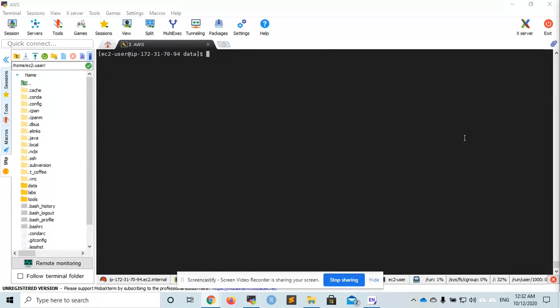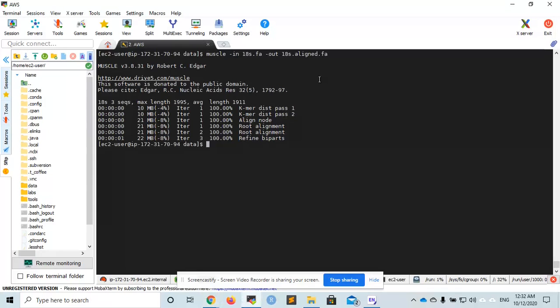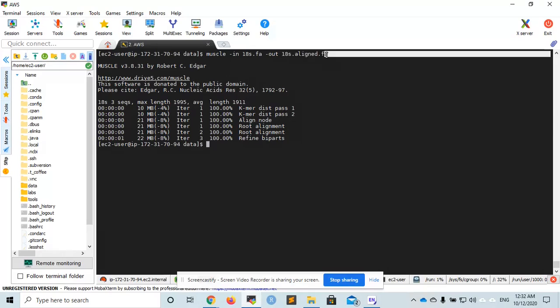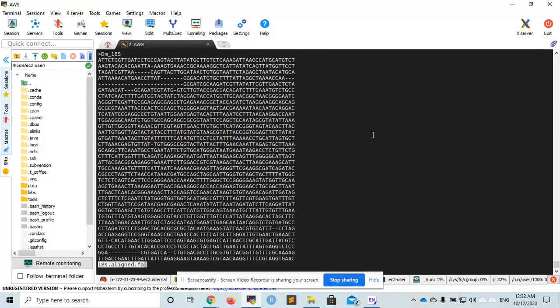We can use MUSCLE to align the sequences, and the output will be another file called 18s.aligned.fa. Let's see how it looks. This is another multi-fasta file with gaps.